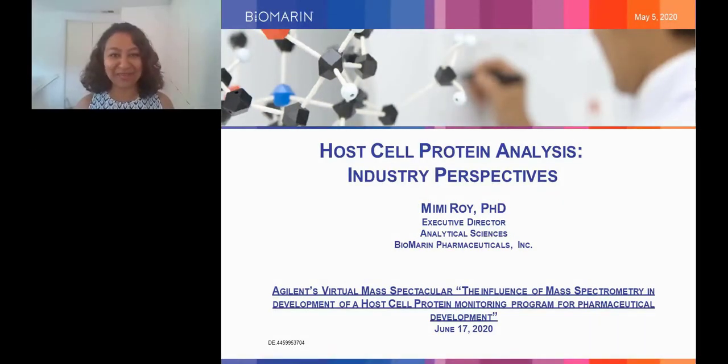Hi, everyone. Thank you for your time and for listening in today. I'd like to speak to you about advances in the analysis of host cell proteins in drug development of biologics as well as gene therapy. I'd like to focus a little bit on how new tools in mass spectrometry have been advancing so quickly, and how these advances can be utilized to come up with better tools for analyzing manufacturing processes.